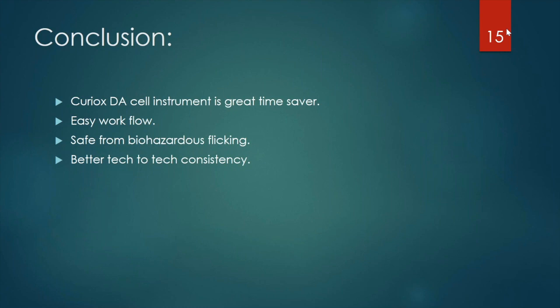And that mixing part is one variable that could show differences between the techs, because I had seen some of the techs who would add 30 microliters, but they would press the pipette all the way down and it releases air into the well, and then they aspirate all the way up. They will take the whole thing. Now, instead of 30 microliters, you're getting 50 microliters, and there isn't 50 microliters in a well. So you're getting air. And by the end of this mixing, they generate so many air bubbles that there's a froth actually.